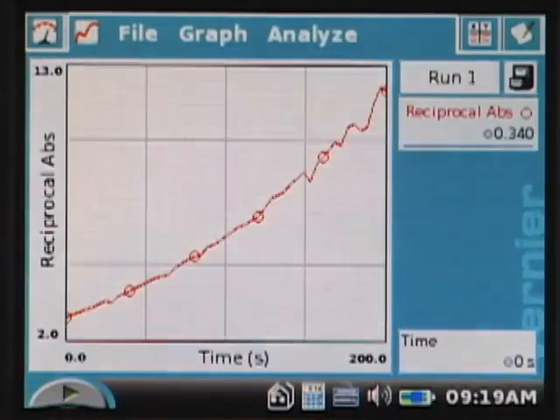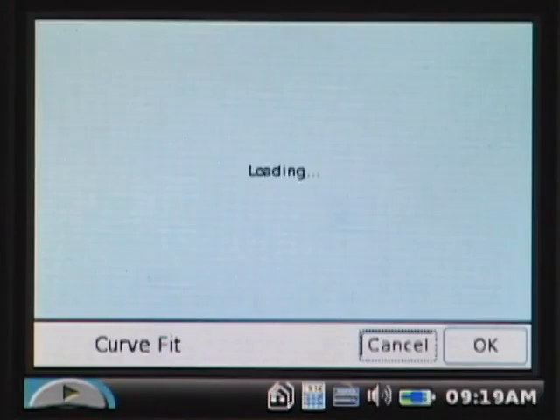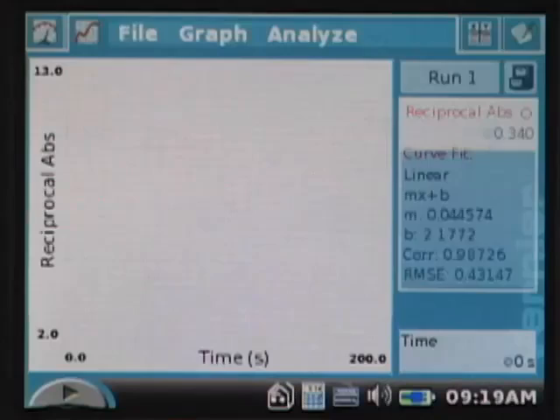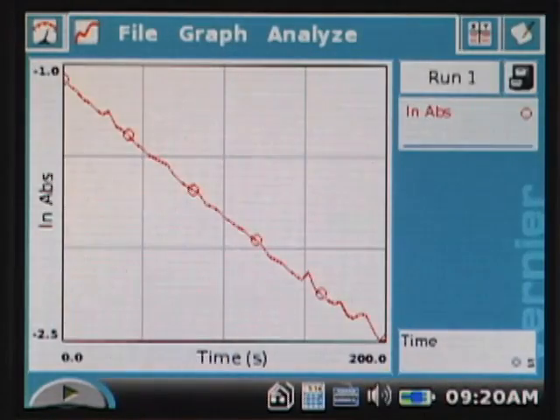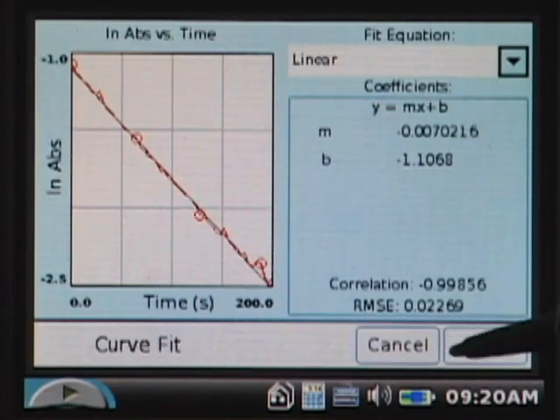Visually it doesn't look very linear. For comparison we put a linear fit on this one, and the correlation coefficient comes out to a much weaker 0.987. Comparing all three correlation coefficients — 0.987 for reciprocal, 0.977 for linear absorbance, and 0.999 for the natural log of absorbance — we reject the first two and the 0.999 value for ln(absorbance) is clearly the best. So it's clearly a first-order reaction with respect to crystal violet. As a student finalizing my lab report, I'd go back to the natural log of absorbance versus time, which gives that very pleasing linear fit.